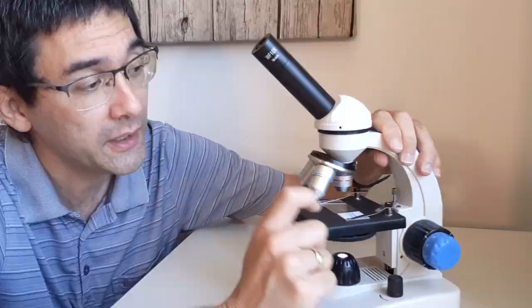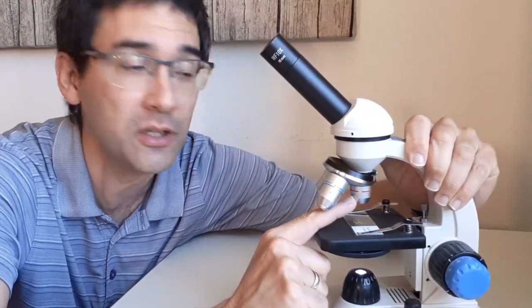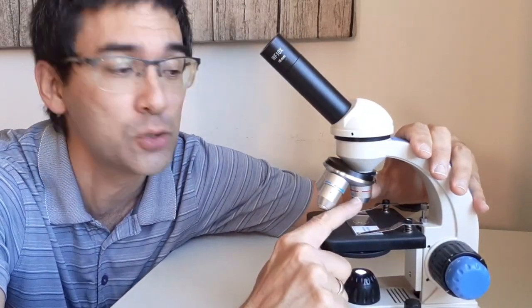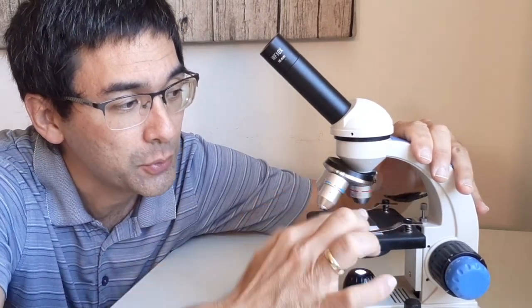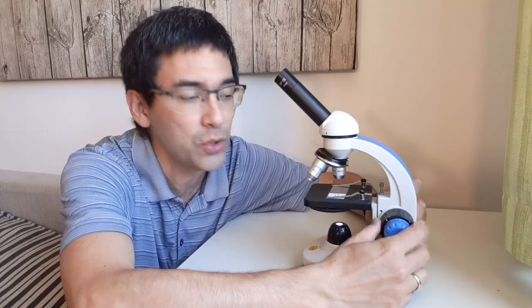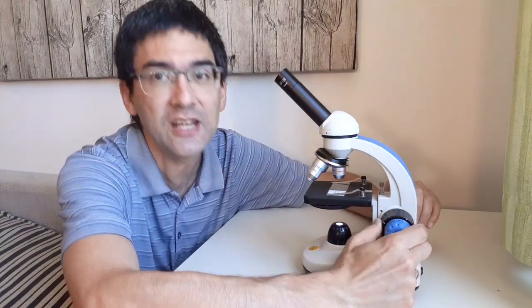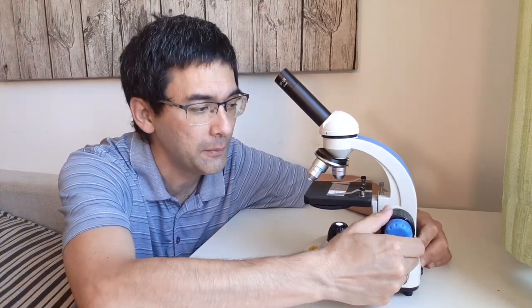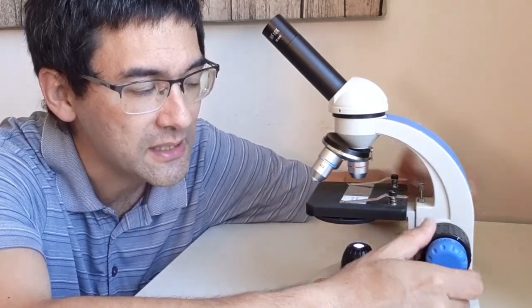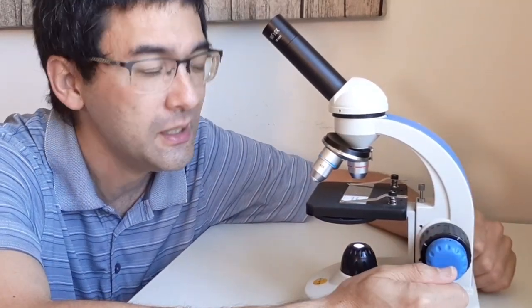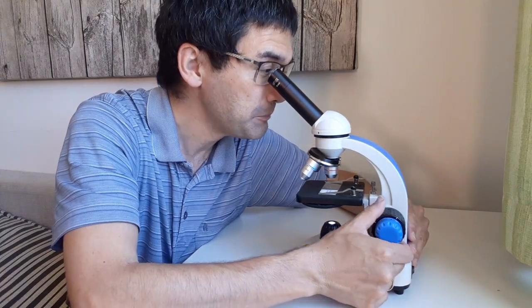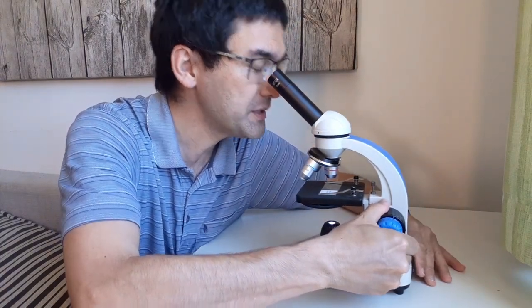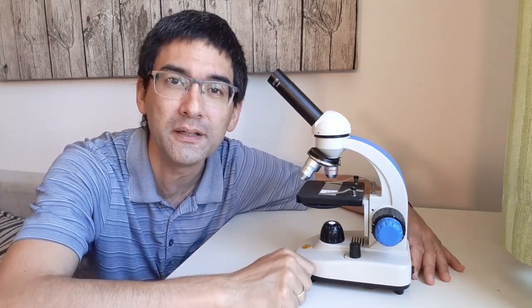So I'm going to give you now the tip on how to do it properly. Number one, you have to make sure that the smallest objective, that's this one here, it has usually a red ring, it's the four times objective. You have to make sure that this one is in position here. And then what you do is you take the coarse focus and you raise the stage all the way to the top. You don't have to worry about crashing the objective into the slide because it doesn't go up further.